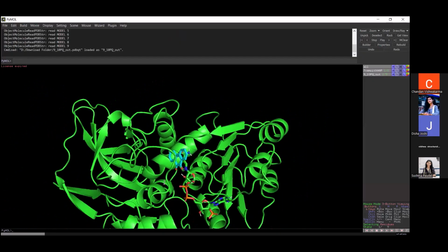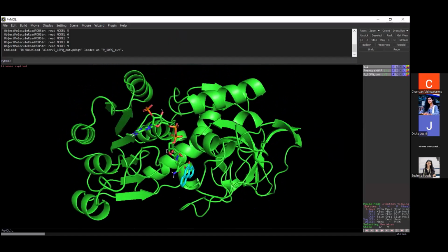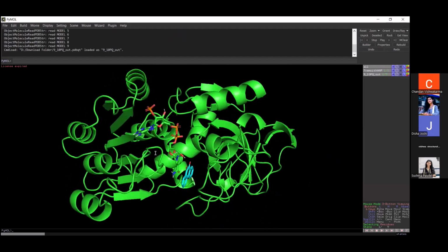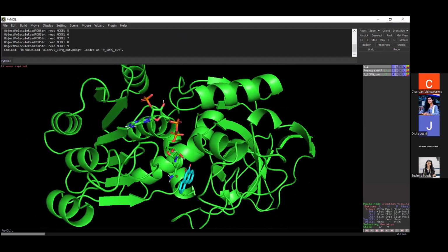Now what you do? You are taking the fifth conformer. Okay, you just do it for all the conformers, share it with me, and then you look at the interaction. For now, see, the first one and second one are the same, the third one is a little bit in opposite orientation. In the paper they have mentioned that this one is in opposite orientation, na? So this one is the right conformation. It may be oxygen on this side, and here oxygen on that side.